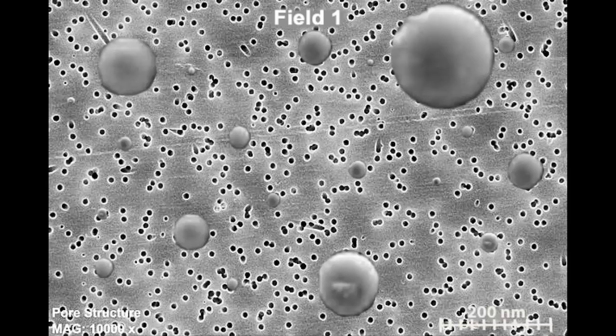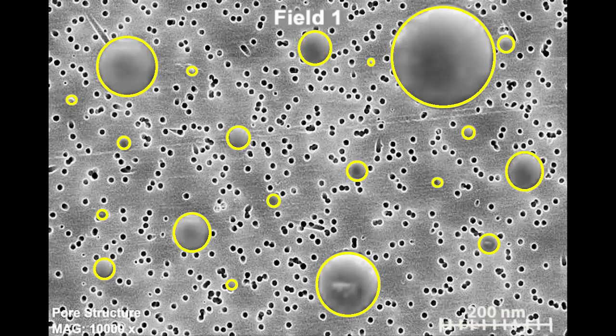For this activity, split the class into pairs or small groups, each one with an SEM field of view similar to the image shown here. The particles are white and gray spheres, and they are collected on a polycarbonate filter membrane perforated by small holes that appear black on the image. There should be approximately 20 particles on each image.